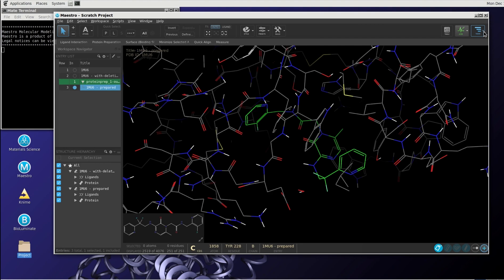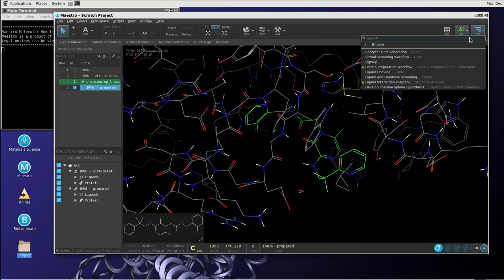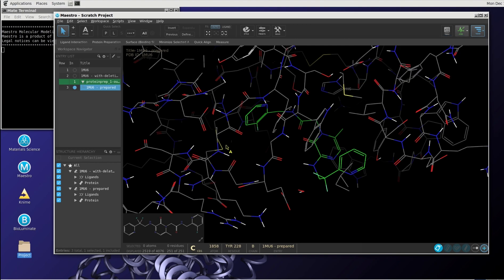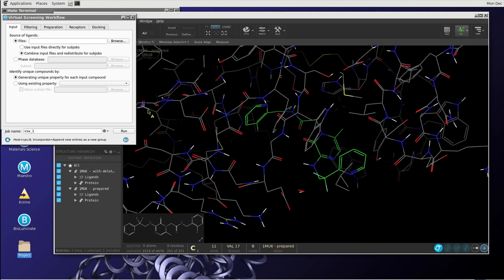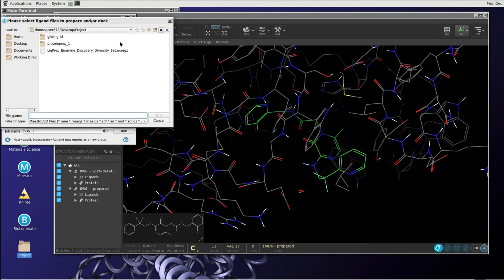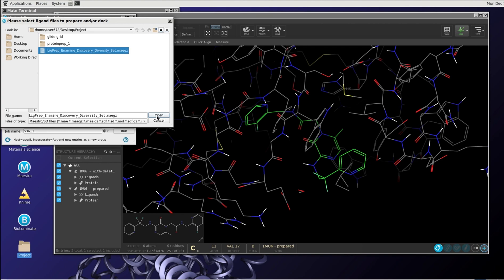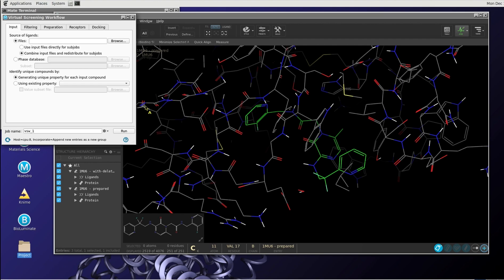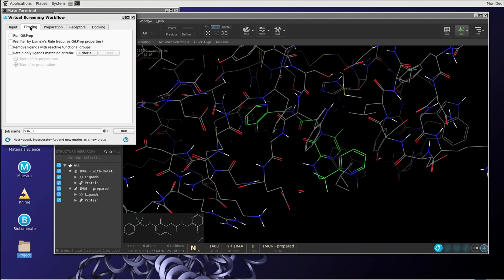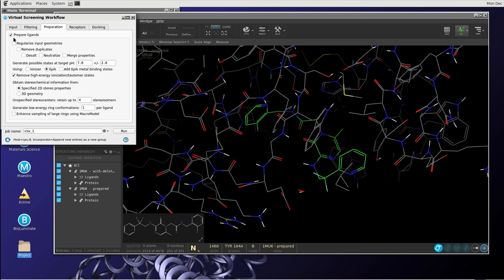And now we can start the virtual screening workflow. Select tasks, virtual screening workflow, and we have to specify a number of things. First of all, we have to select the files. We are going to use this Lichprep enamine discovery diversity set. This is a set of compounds which has already been prepared by Lichprep. So we don't have to specify Lichprep anymore. Filtering, that's okay.